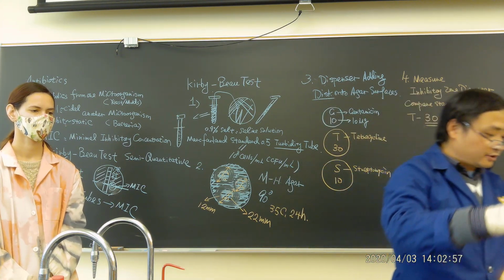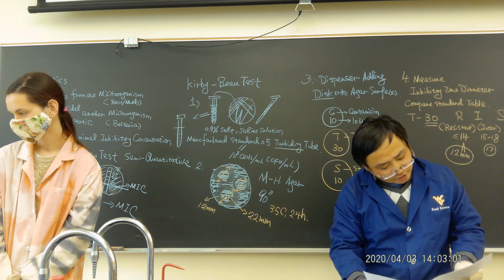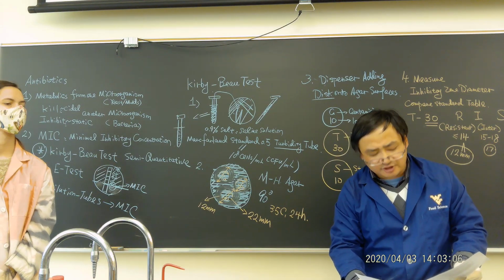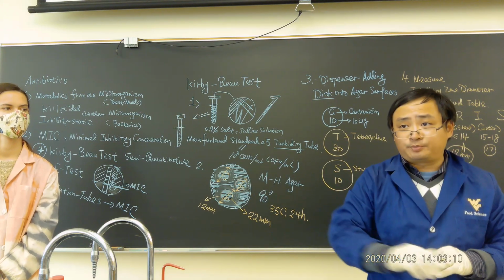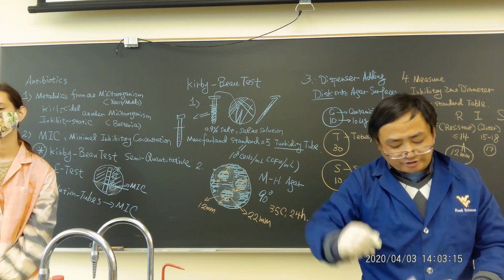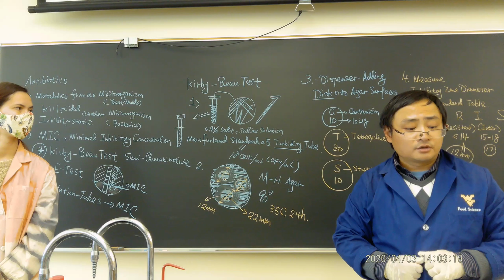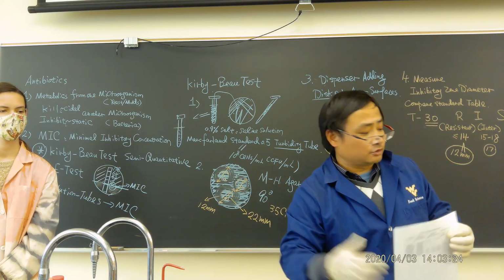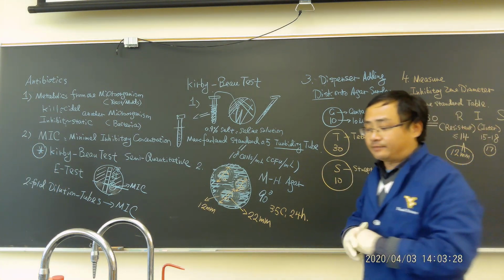Okay, so this is the Kirby-Bauer test for the first one. Now the second part of the fact sheet, what I write is antimicrobials. Using filter paper discs is the same thing, which means instead of antibiotics, we put formalin, lactic acid or any of the antimicrobials there, and you put it on the petri dish. It's the same thing. So we skip that. Okay, I usually do it, but I skip it. Okay, so this is the first part of the lab.